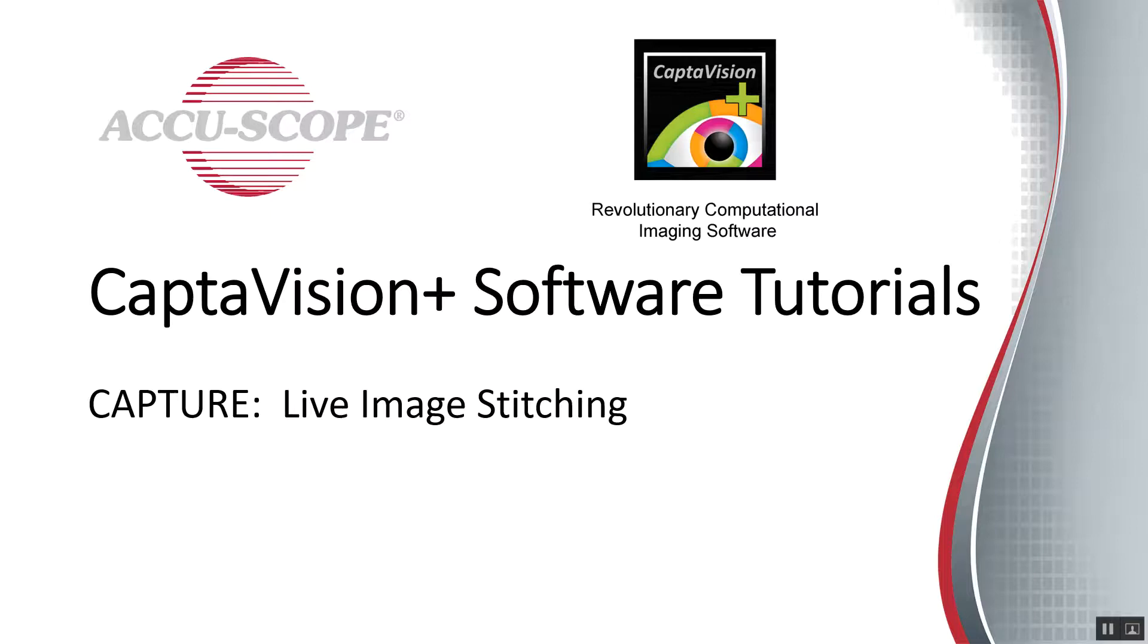Welcome to our CaptaVision+ software tutorials. In this tutorial, you'll learn how to use the live image stitching function in CaptaVision+.